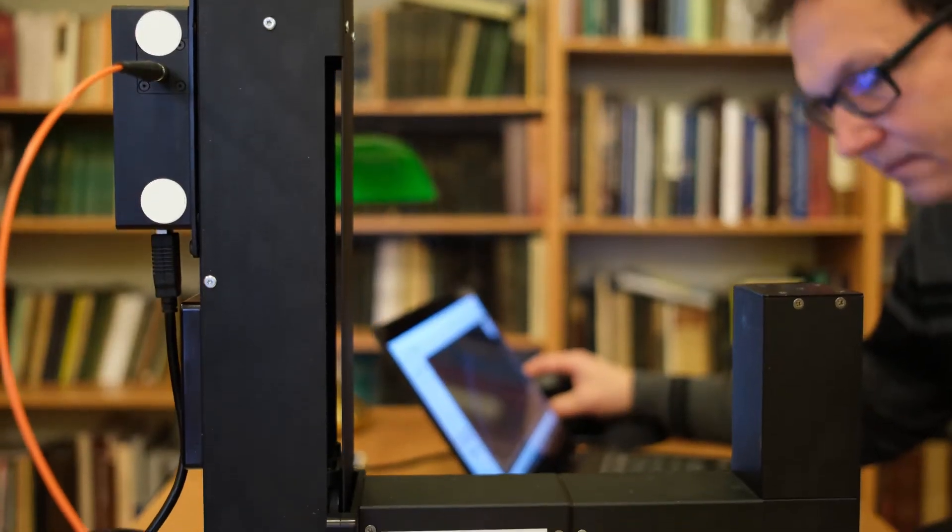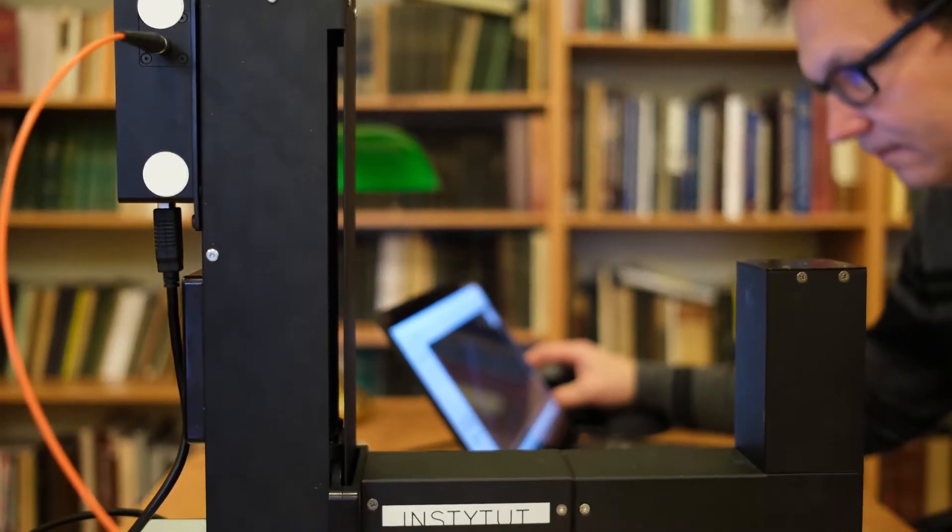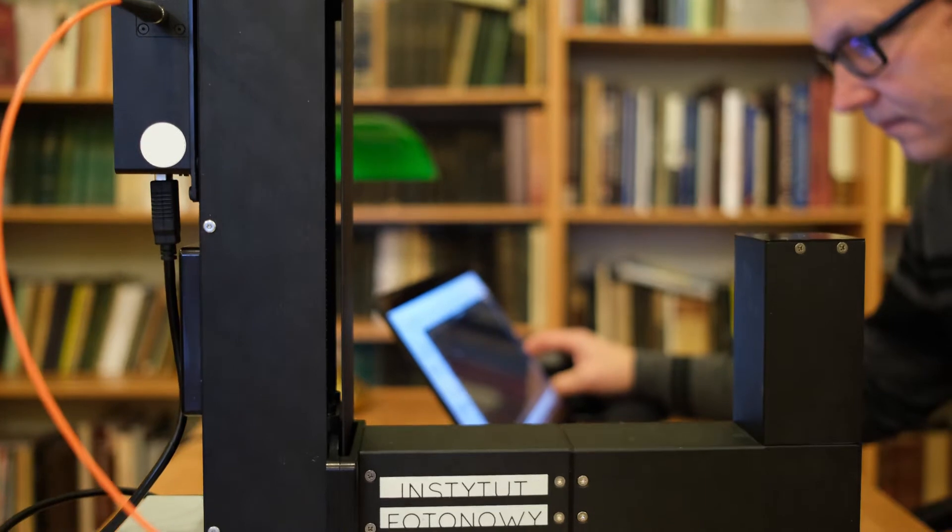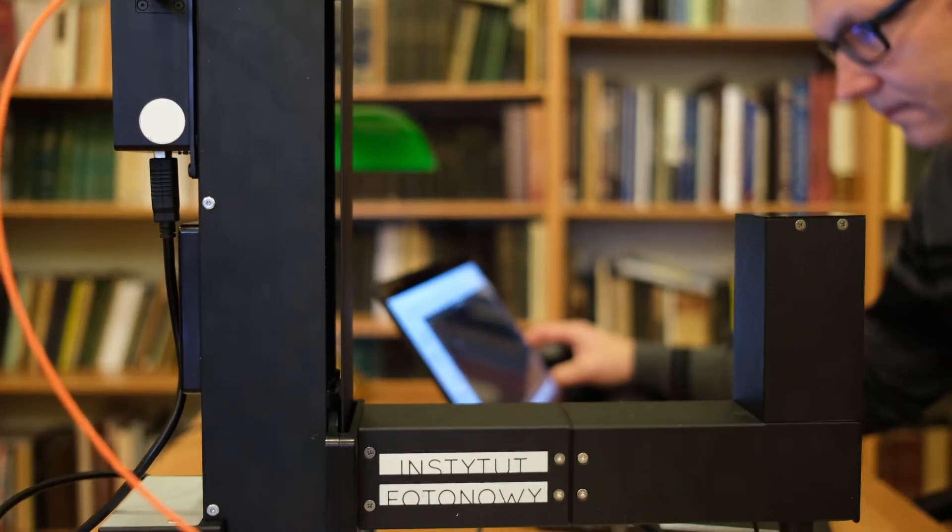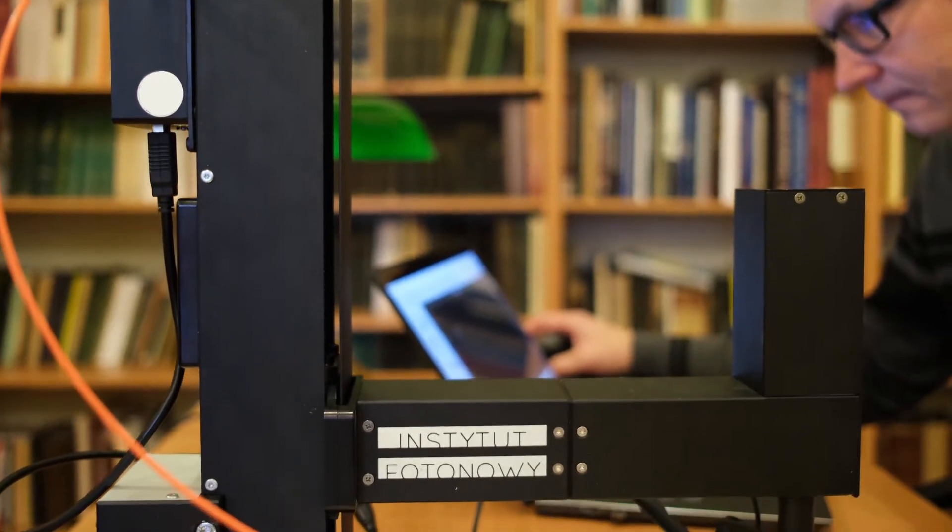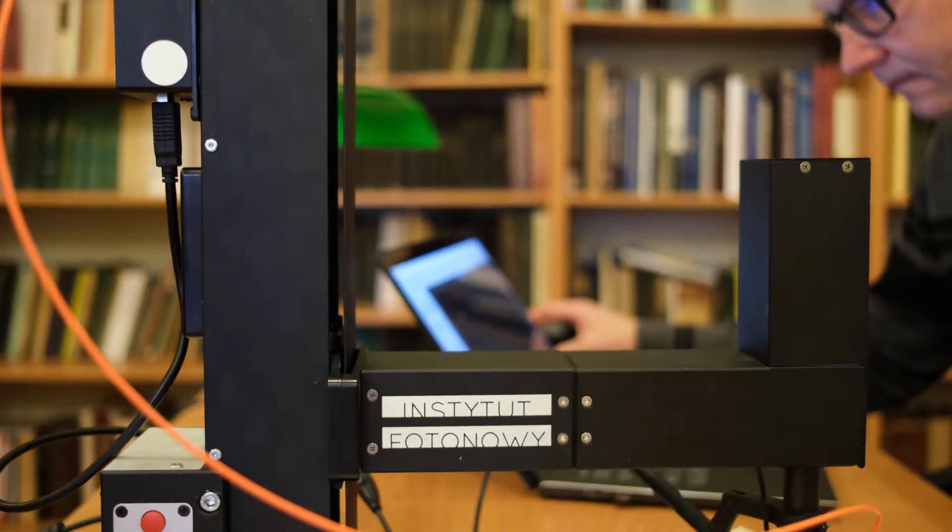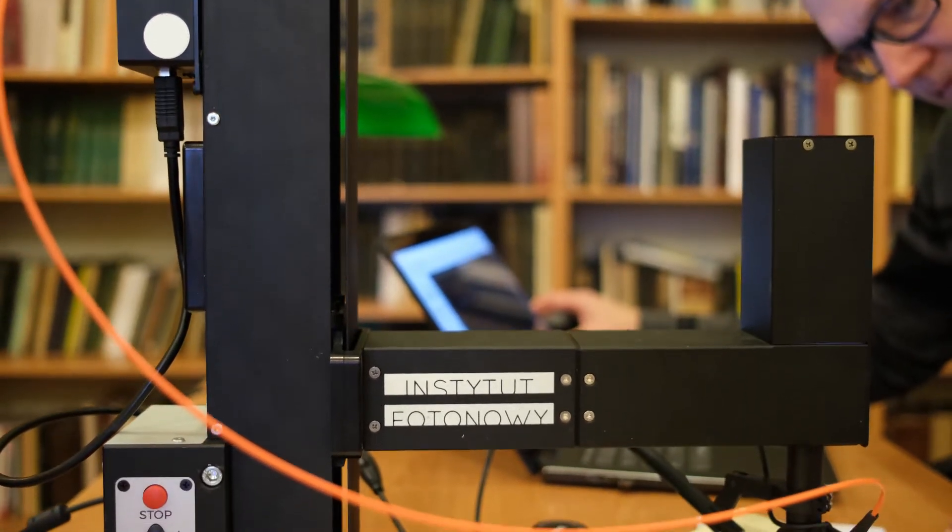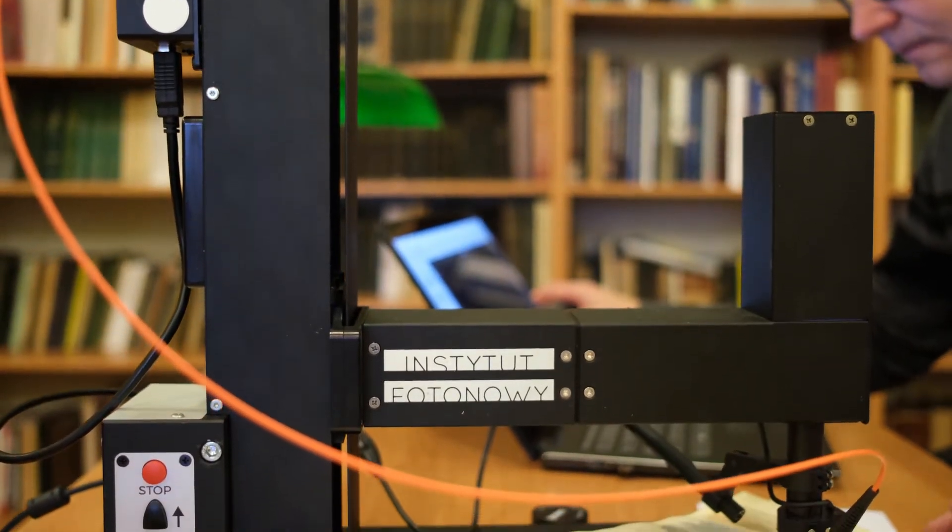Now, with Instytut Fotonowy Microfading Tester, color stability in artworks may be easily measured in a non-destructive way.